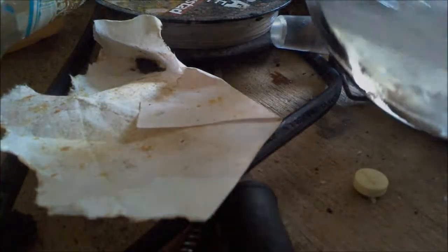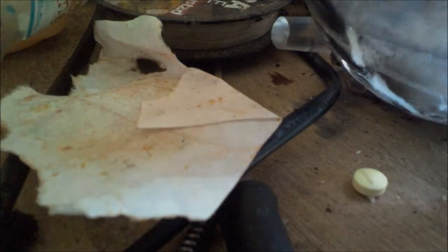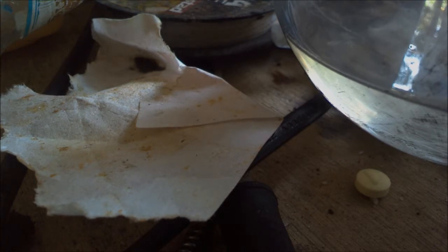Once you have gotten all of it to dissolve, you need to get the liquor. As you can see, pour it into a beaker.